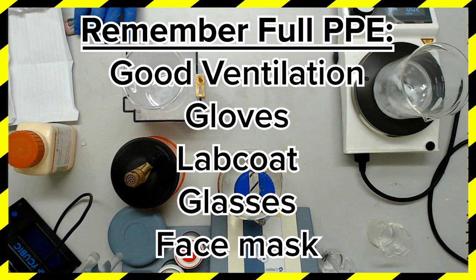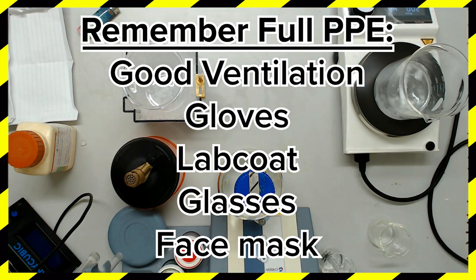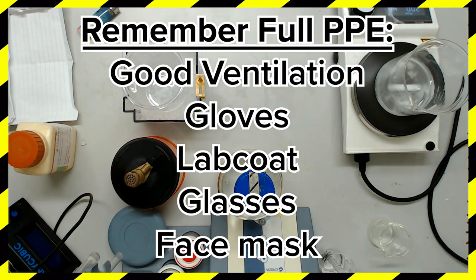A fume cupboard is best, but an air-conditioned space will suffice. Gloves, lab coat and glasses are a must for the mixing and usage of this buffer. Wear a face mask if you want to be especially cautious. You should probably wear this stuff all the time, but I want to emphasize when it's really really important.